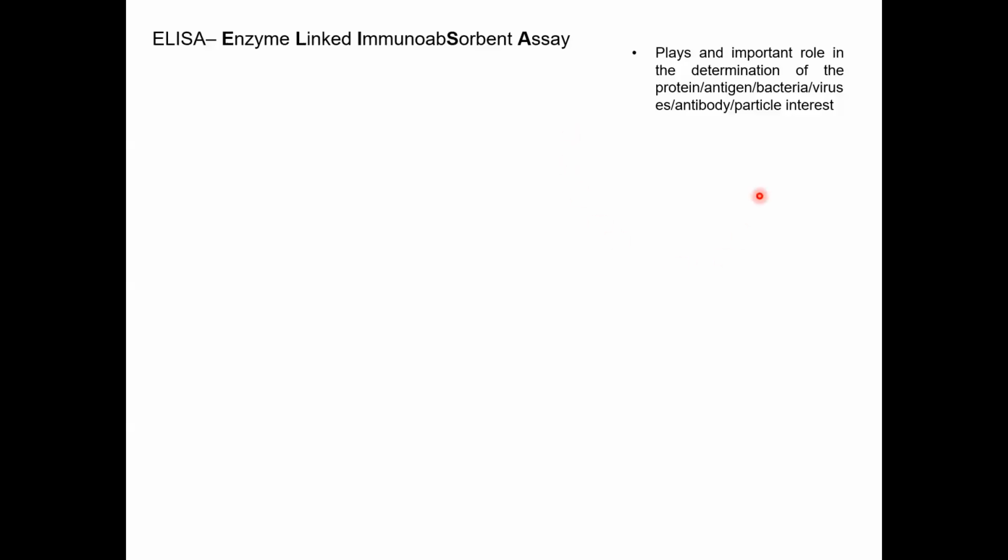Welcome back. As I promised you before, I'm going to make a video about the ELISA method. But before we jump in, let's talk briefly about the ELISA.